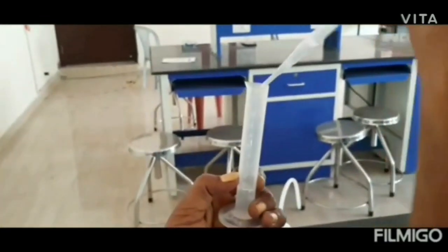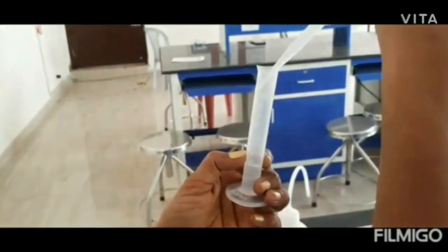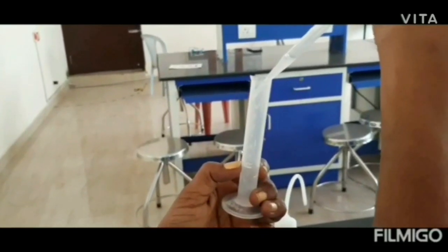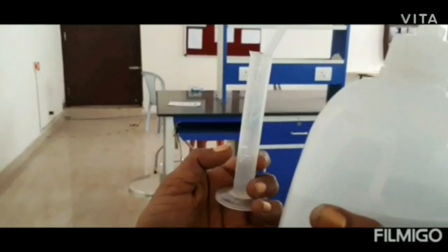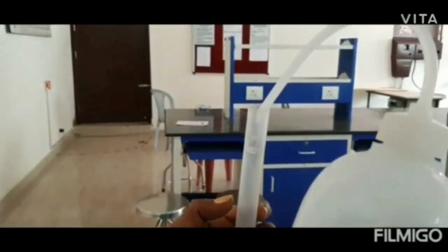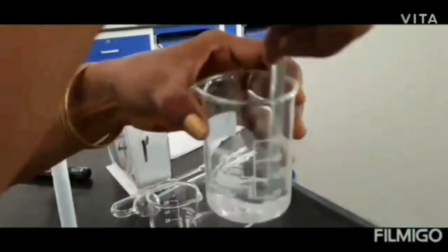Then next, to prepare the 0.4 concentration, 4 ml of the 1% PVA solution is added into the 10 ml measuring jar, and then 6 ml of distilled water is added to it.